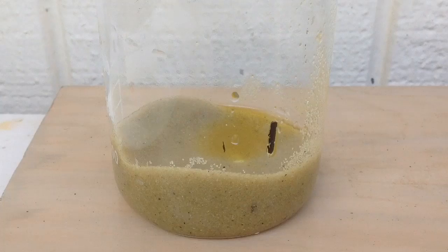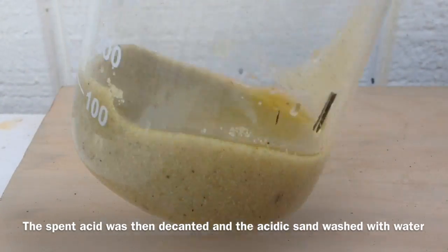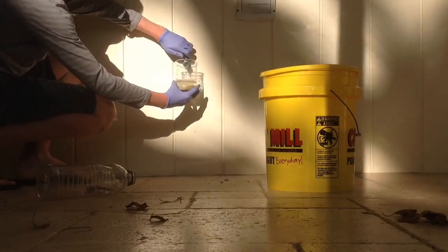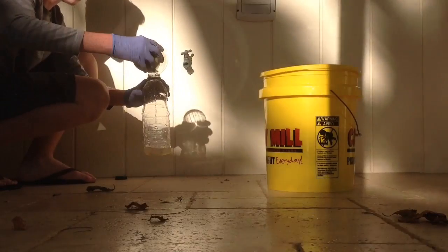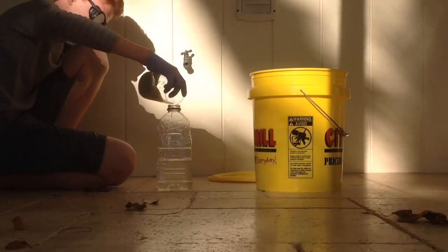Now that we have our acidic sand, we just wash it with water. Here's a time-lapse of the washing — we want to get it to about pH 7 to get rid of all the acid residue.